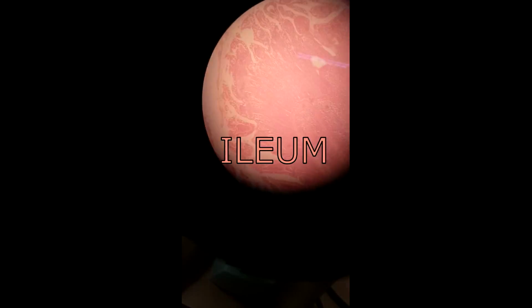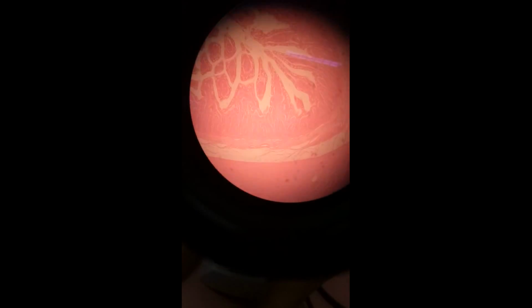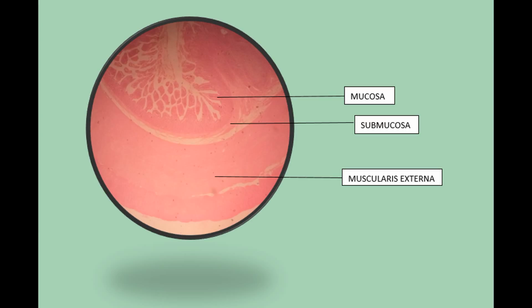Okay, the next slide we're going to observe is the slide of ileum. Ileum is the final section of the small intestine that empties into the large intestine via the ileocecal sphincter. The ileum is about 6 feet long and completes the absorption of nutrients that were missed in the jejunum. Okay, the layers of tissue that can be observed in the ileum are mucosa, submucosa, and muscularis externa.